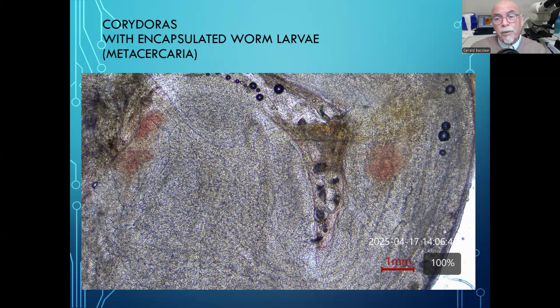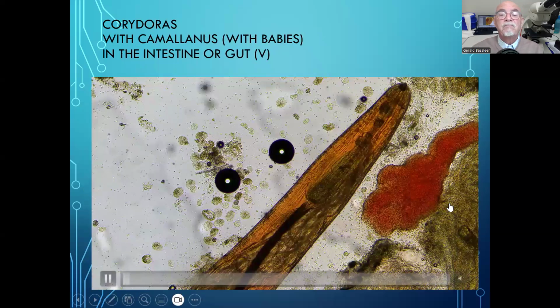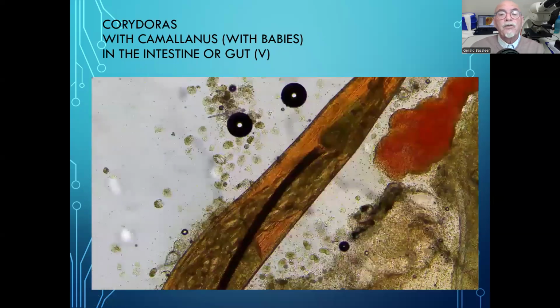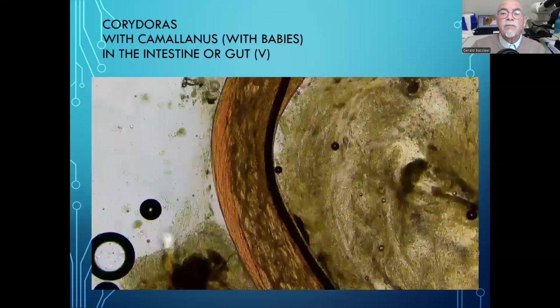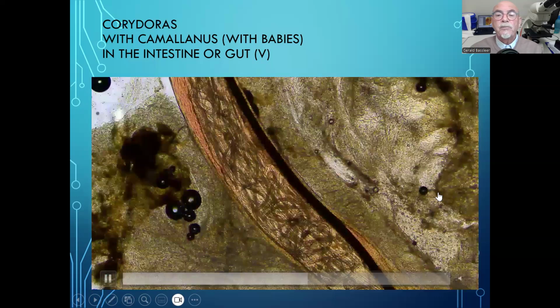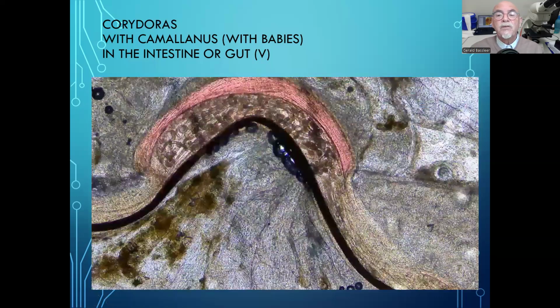Particularly that roundworm, the big nematode Camallanus, is something else. This is really troubling the fish. If you see this, we can imagine that the fish will be bothered by something big like that with all those babies. Here we can see one more tubercle. Sometimes you see tubercles next to it in the intestine, here other parts, but you see this big, large nematode.